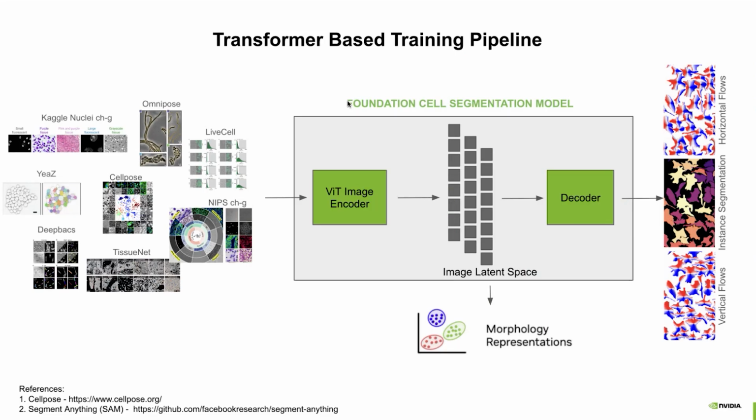So in a nutshell, I'm going to describe how this works, and this is all open source, by the way. Inside of it, your input is an image. And once again, there's a variety of these microscopy images. As my colleague mentioned, there's a variety of MRI images, modalities. I feel like here there's even more. There are different tissue types, there's different shapes of the cells. There are many different things.